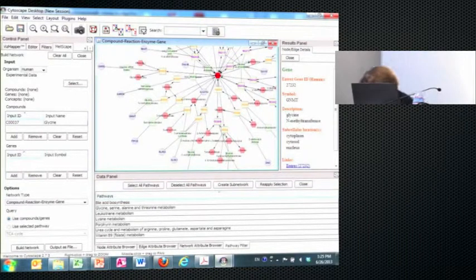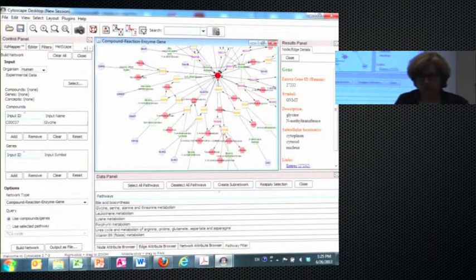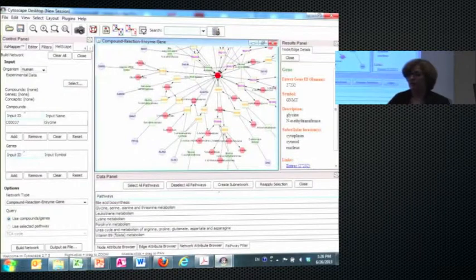Okay. So the data that we're displaying here comes from the database that we used to draw these relationships, the Edinburgh Human Metabolic Networks. They have the subcellular locations, and the subcellular locations are associated with reactions. That's part of the data that we got from that database. Okay? All right. That is exactly right, and actually that is where I'm going next.